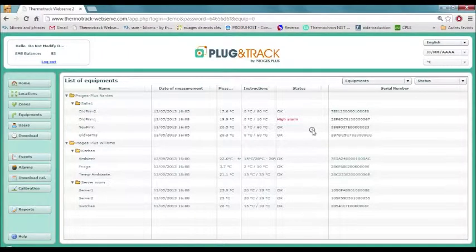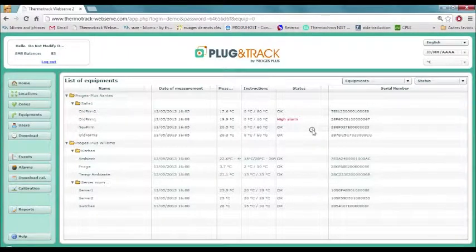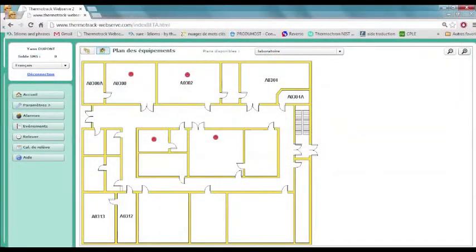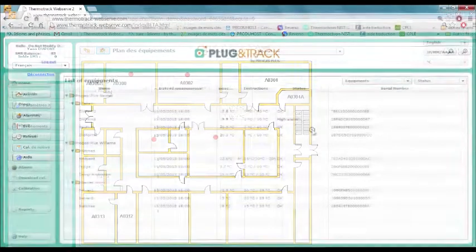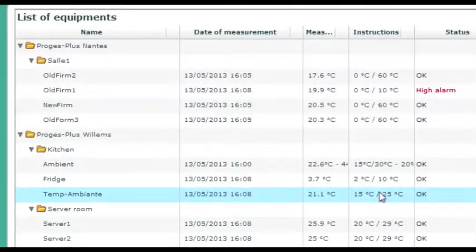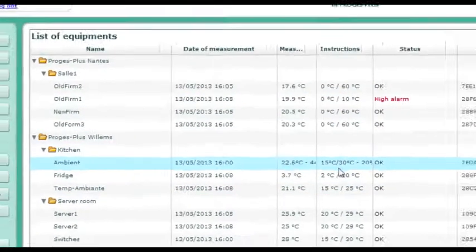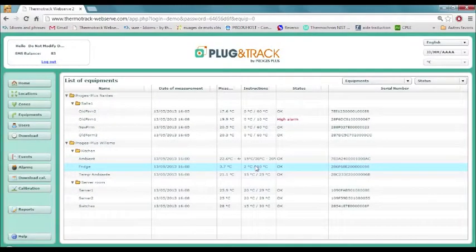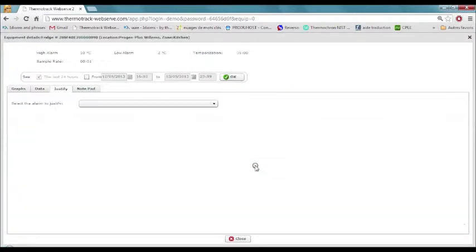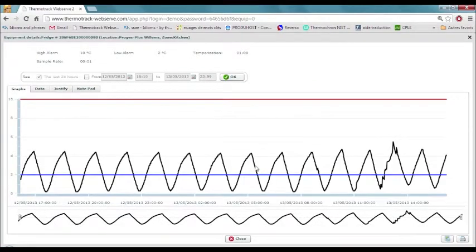The home page shows the list of all sensors that you have installed. You can also view them on a map if you prefer. We can see here in red that one sensor is in high alarm. Let's click on one of these lines to see the details.